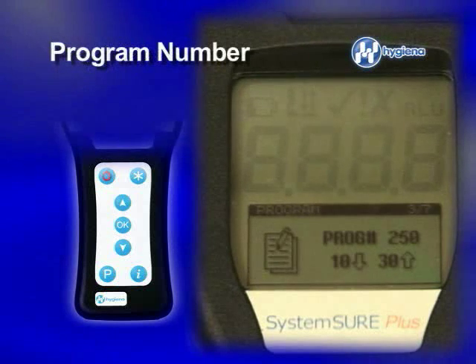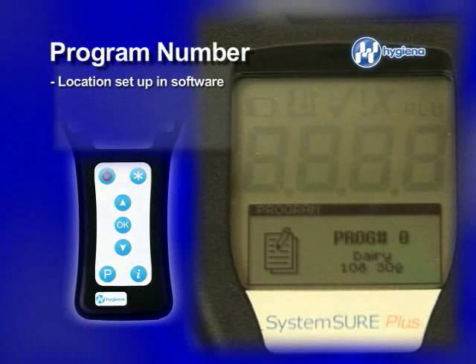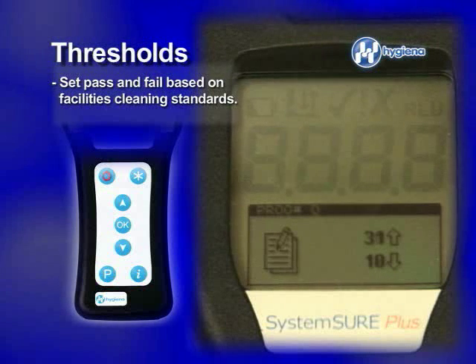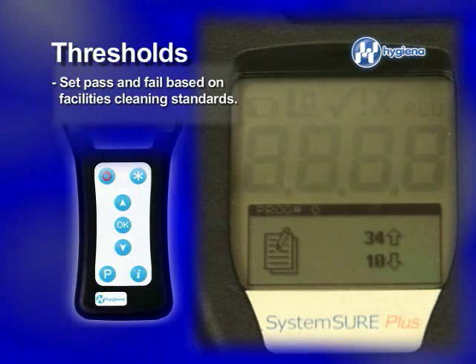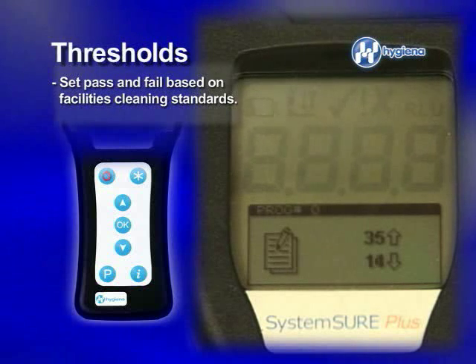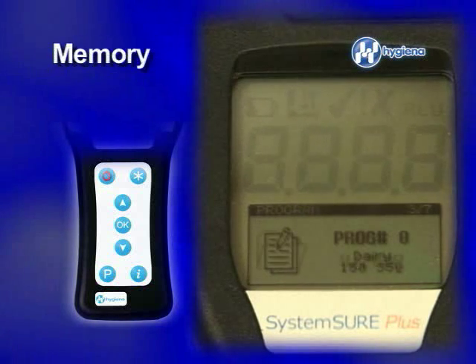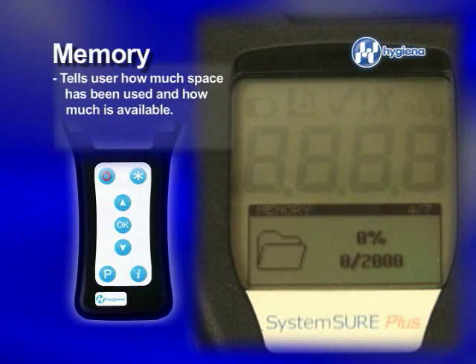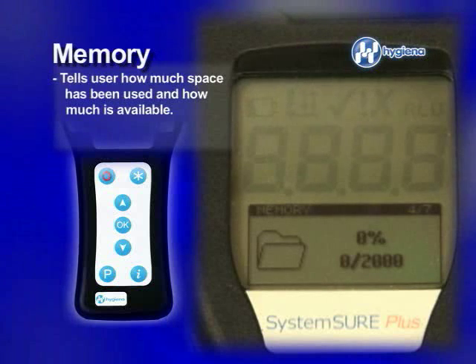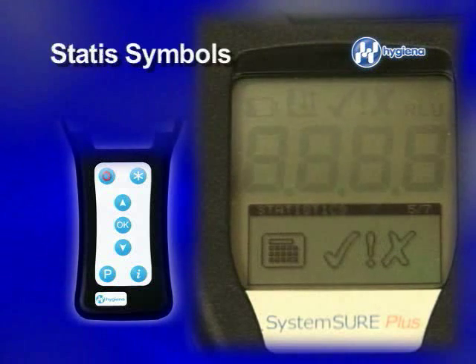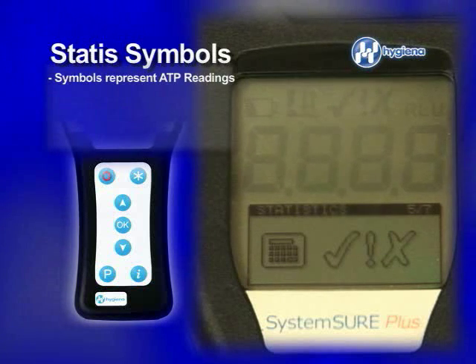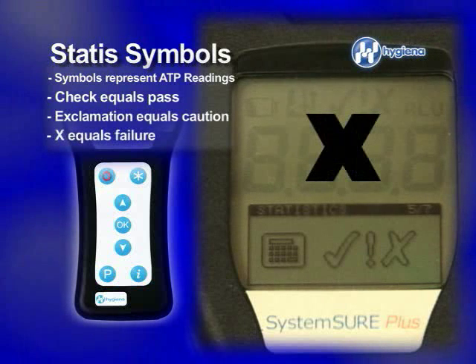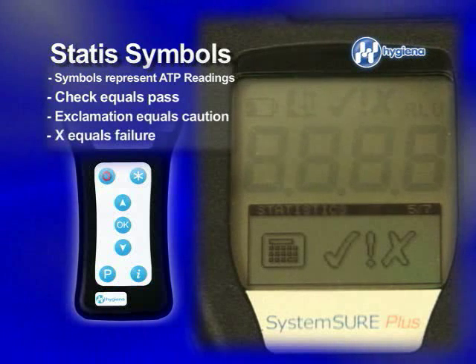Moving on, scroll up to your program number. This was also previously set up in your data software. This is where you also set up your thresholds — scroll up or down and press OK to select. Next is memory, which shows you how full of information your device is, how many tests, and what percentage of memory is occupied with data. The following are your statistics. These symbols represent your ATP readings: a check means clean, an exclamation point for caution, and an X for failure. These readings are all relative to your threshold settings.